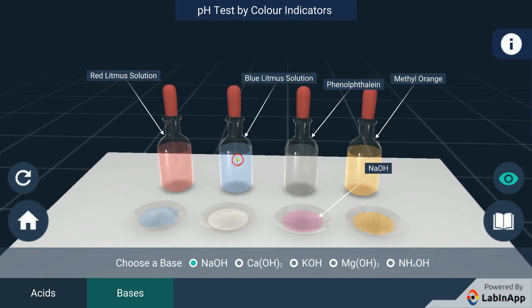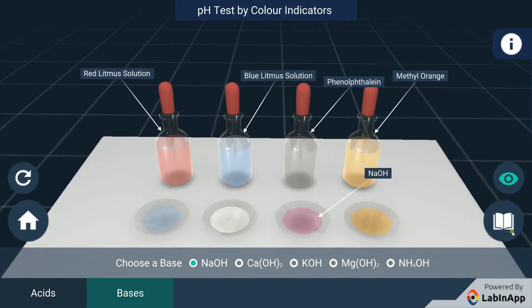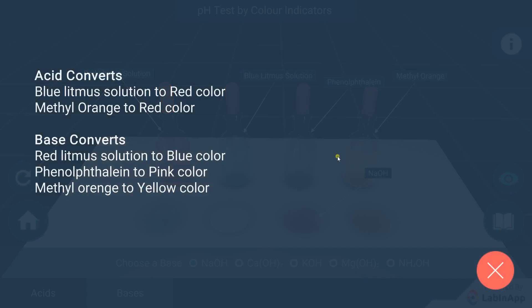We can conclude that a solution that changes its color by adding blue litmus solution to red and methyl orange to red is an acid. The solution which changes its color on adding red litmus solution, phenolphthalein and methyl orange to blue, pink and yellow respectively is a base. This is how we can identify acid and base solutions using indicators.